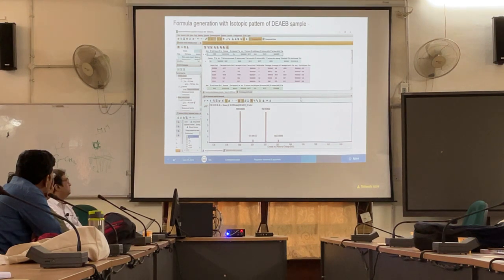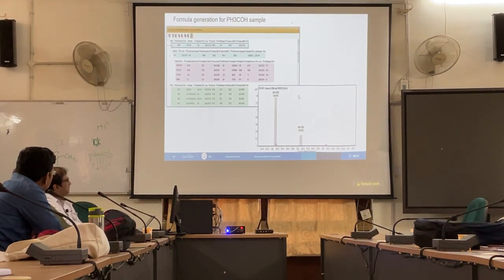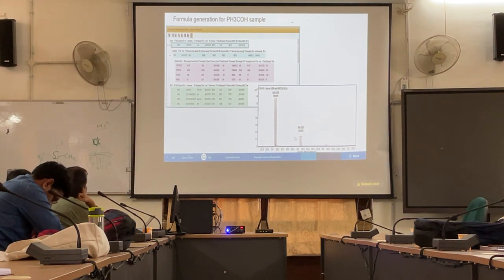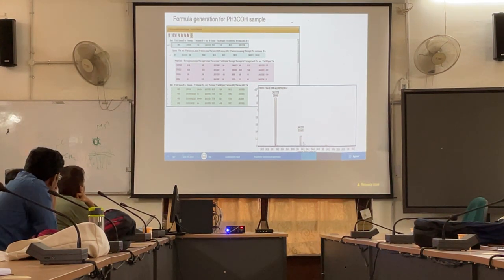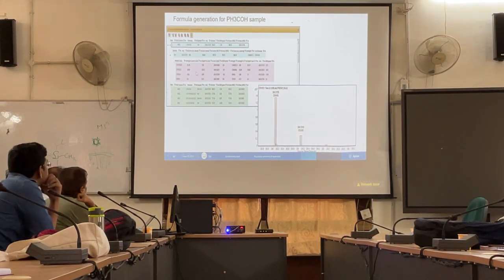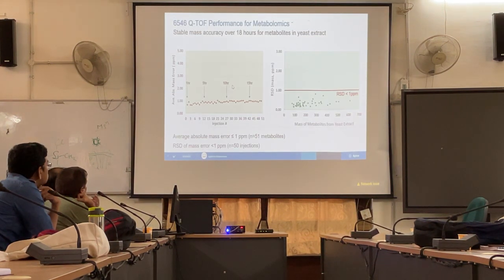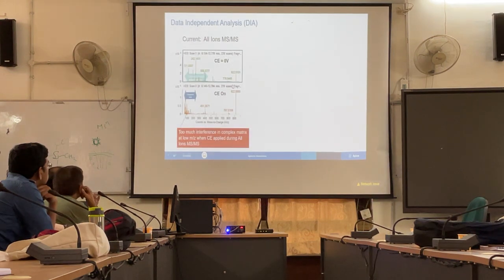Synthetic chemistry people use this. This is more closer to your natural product chemistry where you don't have bromine, but C19H15. So this is the ratio of the isotope, second isotope. This kind of analysis is only possible with HRMS, nothing else. And all those things. So now we'll establish something about how you interpret the data.